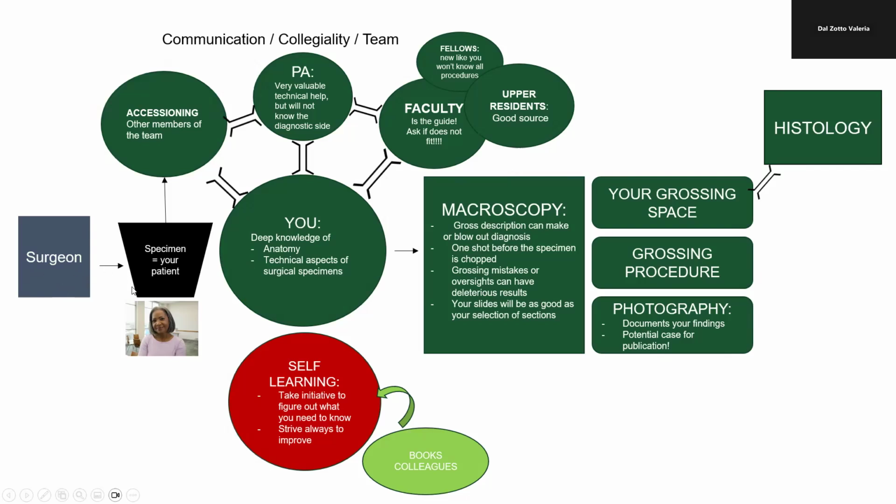But your specimen is going to be your patient. The surgeon is going to take a piece of tissue from the patient, and your specimen is going to be your patient. So you are going to treat that specimen with knowledge, with care, and keeping in mind that you are the steward of that patient's specimen, of that portion of the patient. You are also going to interact with another area very related to the gross room, the surgical pathology department's accessioning team.